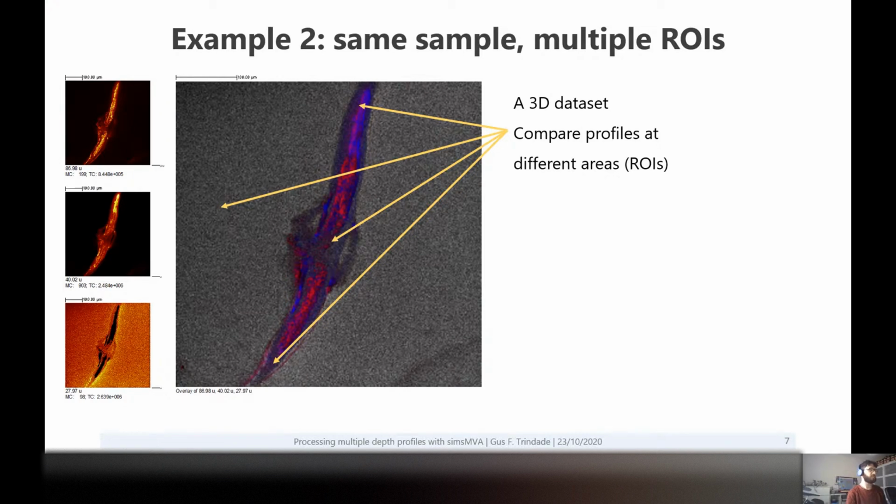So yeah, these are the slides. From this point, I'll do a practical demonstration. If you have questions, just stop me. I think it would be nice if you have questions, because it's a bit strange to do these practical demonstrations without anyone giving feedback. So feel free to either type in a text or just say something, just interrupt me, it's fine.